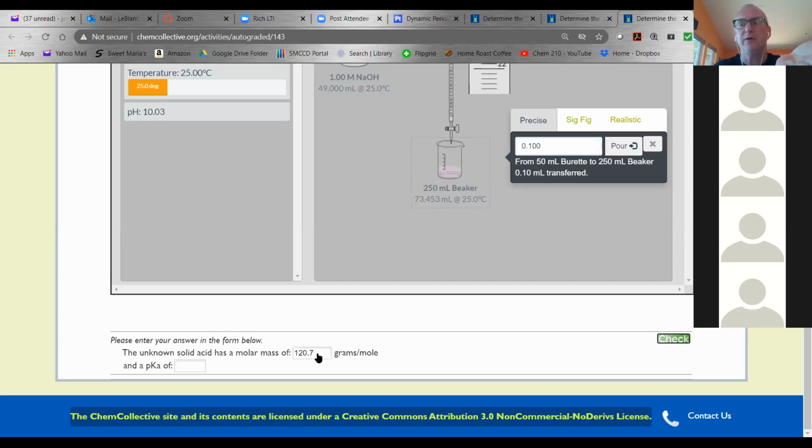Remember, we only have 3 significant digits. With 1.00 molar, I should have 121 too. See, you answered it better than I did. But I had 104. Yeah, it just means you had a different one. How can I know my answer is close to the right thing? We won't, unfortunately, because we didn't calculate the pKa.